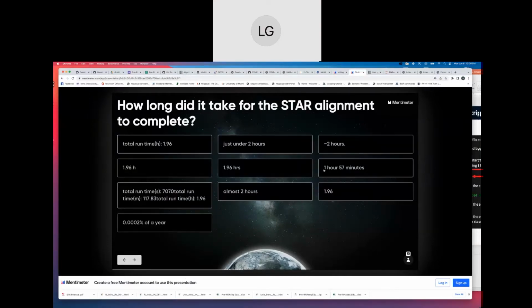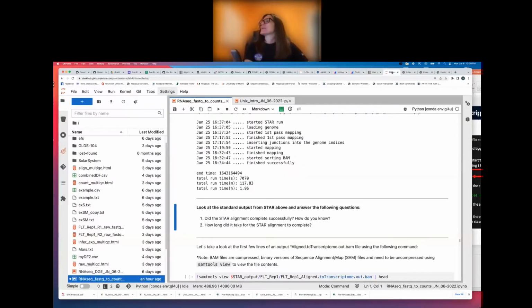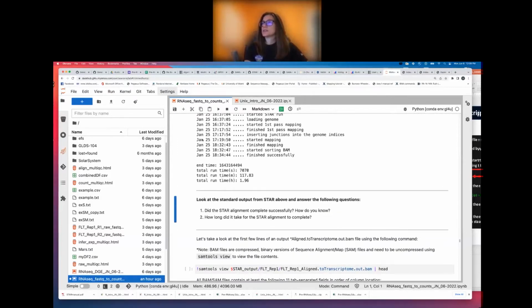1.9 hours, just under 2 hours, hour and 57 minutes, 1.96, almost 2 hours, 0.0002% of a year. Yeah, so we know this a couple of ways. So I add timestamps to the start and end of all of my scripts to keep track of this. So you could have just used that, which I think a lot of you did. The other thing that's nice about STAR is it gives you timestamps in the standard output. So it tells you when it starts and then it gives you a timestamp for when it ends. So that's another way that you could tell just from the STAR output itself without the extra stuff that I had in there. And just to show you guys, this was 2 hours.